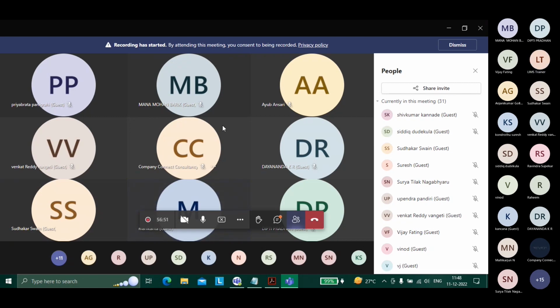So to solve the bugs in Labware LIMS, what is the language they use? For solving bugs in Labware, they don't use a language. See, there are already some custom-made LIMS basic codes created by the client, right? Those are used for the pharma template. They are used by LIMS for automating the process. For example, if there is something wrong, or if they want certain modifications, you need to go and modify those. It is the same LIMS basic code which I am telling you. In Labware LIMS, there is nothing apart from LIMS basic code.